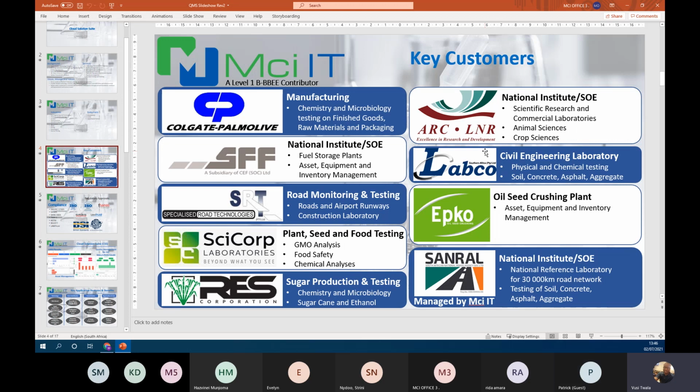Whichever standard they are, our systems are very responsive to whatever standards your country has. Fortunately, just to add, the ISO standards apply globally, especially for the LIMS module and the quality management module, and an asset is an asset. So I don't foresee much deviation in requirements.